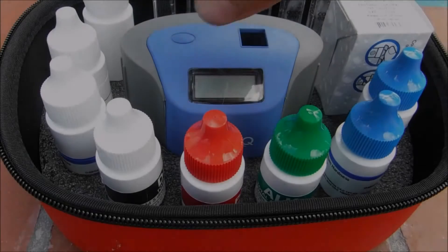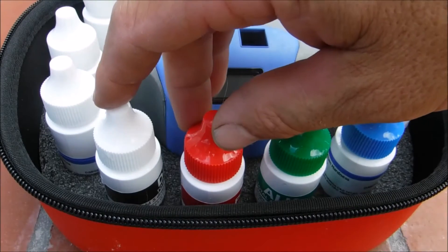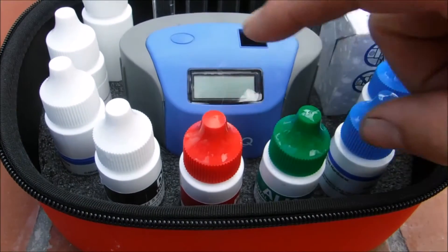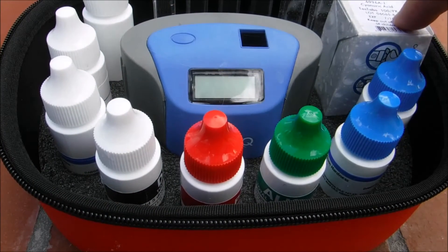This test kit uses DPD. It'll test for free chlorine, total chlorine, and also bromine, pH, alkalinity, calcium hardness, and also your cyanuric acid level in your pool.